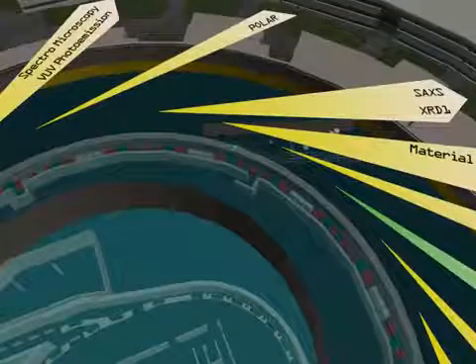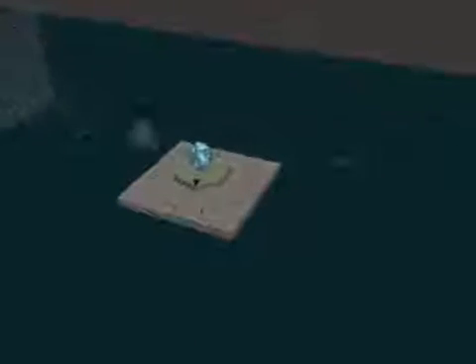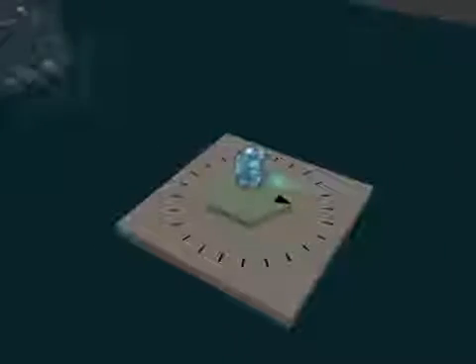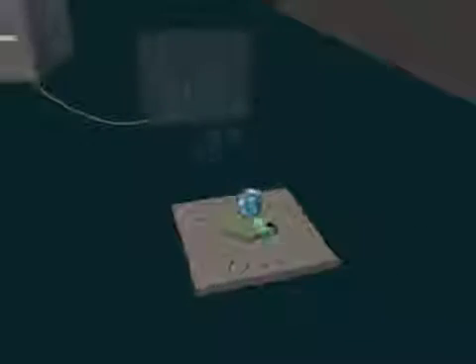For example, the X-ray diffraction beamline allows us to study the structure of viruses and proteins by locating their atoms in space. Like all the other beamlines, the X-ray diffraction station includes various optical devices that select the needed wavelength and terminates with the experimental chamber where the sample is located. The light, in this case X-rays, interacts with the sample, for example a protein, in a particular way, according to the position of the atoms.